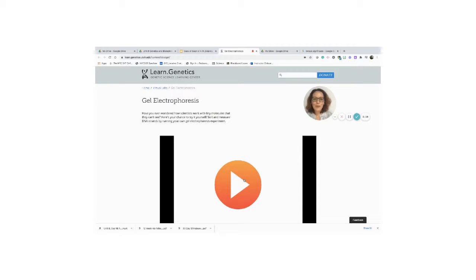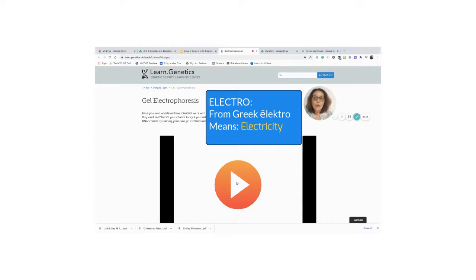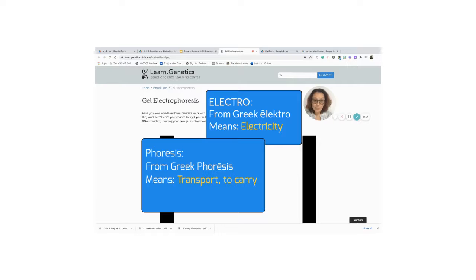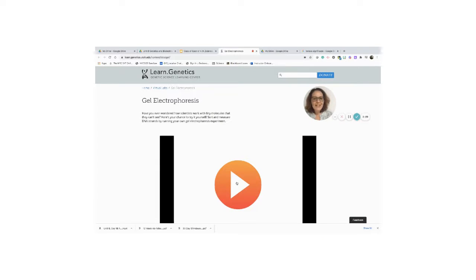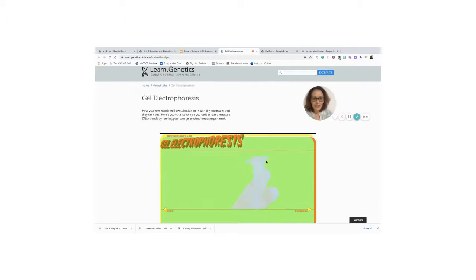All right, here we are, gel electrophoresis. Remember, the word electro means electricity, and the word phoresis means transport. All right, so you are transporting electricity through the liquid. That's what electrophoresis means. Have you ever wondered how scientists work with tiny molecules that they cannot see? Here's your chance to try it yourself. Sort and measure DNA strands by running your own gel electrophoresis experiment. This is going to be really cool.